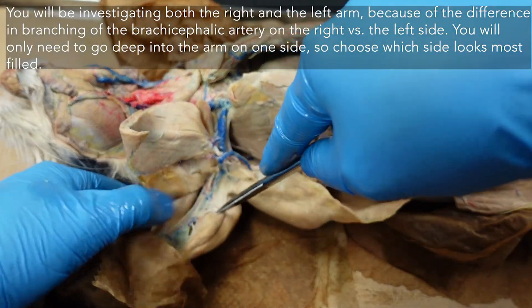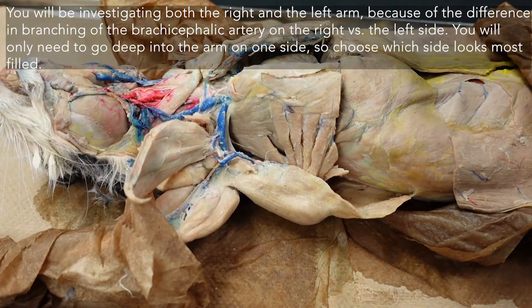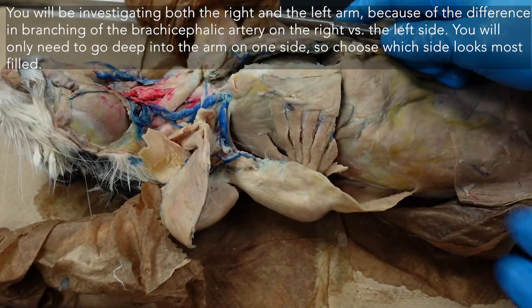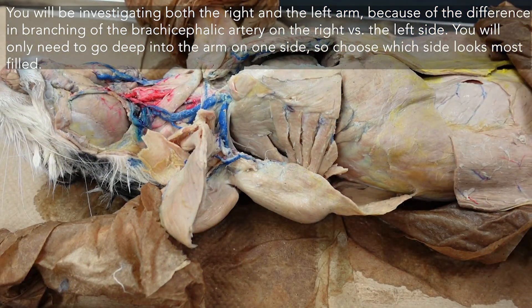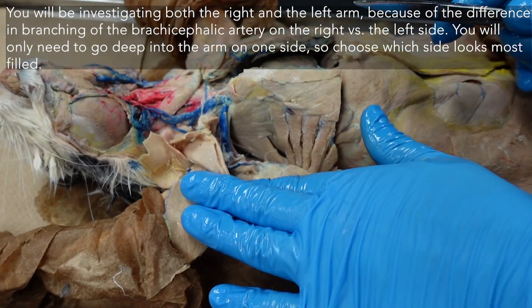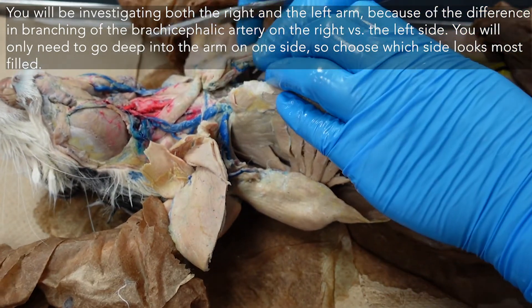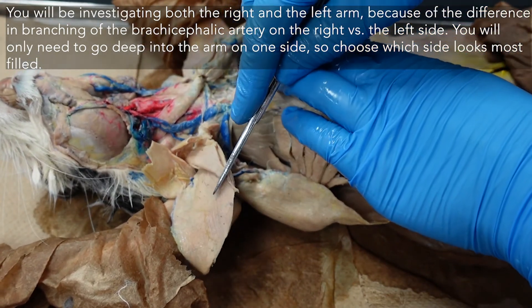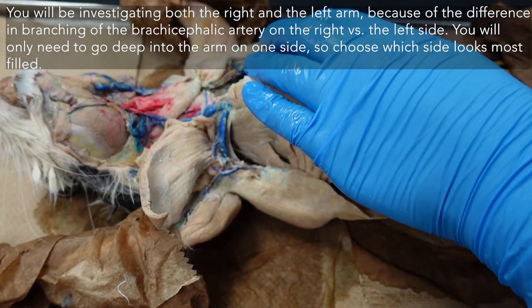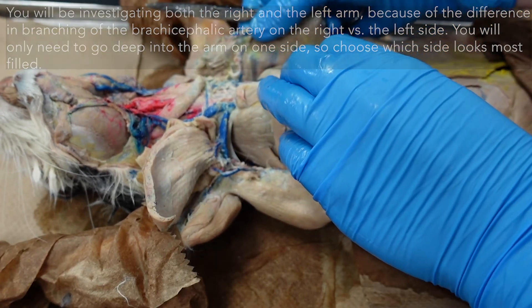You'll do the same on your right side — this is the side that you've left untouched. Since we did muscle work on the right side, there may be some structures that are slightly disturbed from our muscular investigations. So anything potentially broken on this side you will have intact on the other side. That's why we leave one side untouched — so we can have an uninterrupted circulatory exploration. You'll do the exact same thing, following the channels all the way out to the elbow on both sides.